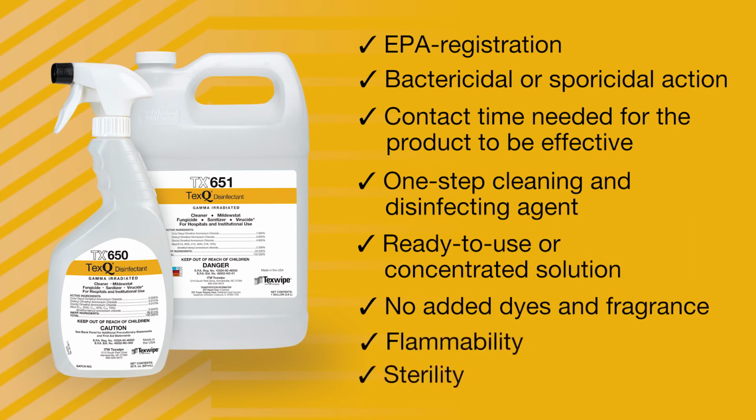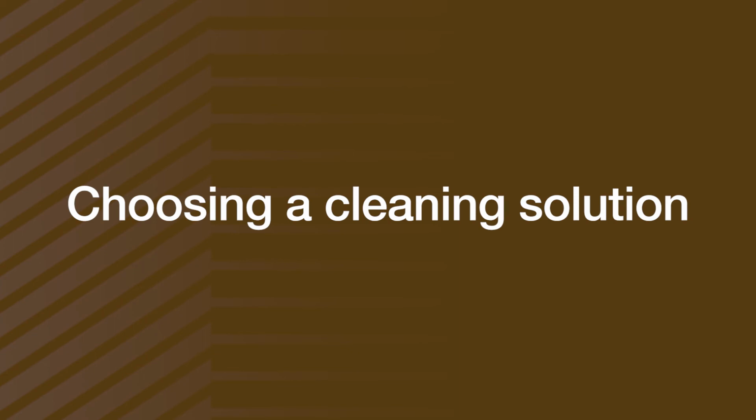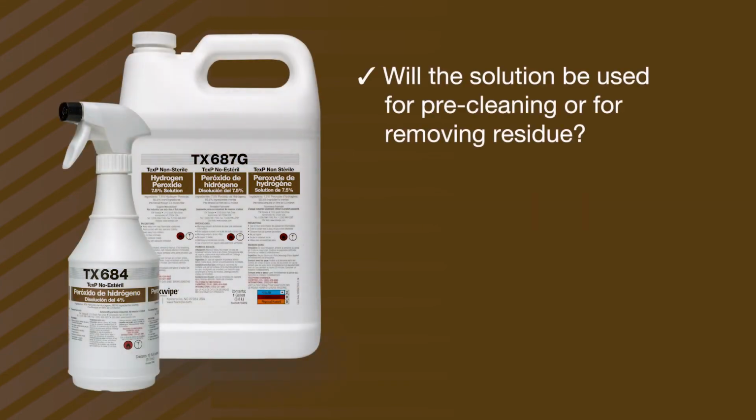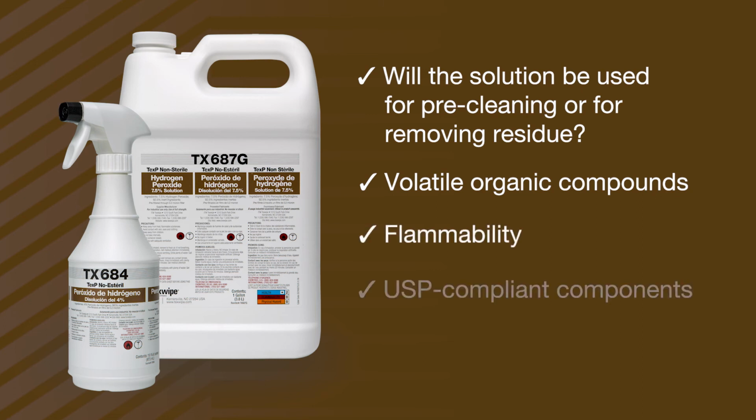flammability, sterility, and others. When choosing a cleaning solution, consider the following: will the solution be used for pre-cleaning or for removing residue, volatile organic compounds or VOCs, flammability, USP compliant components, sterility, and others.